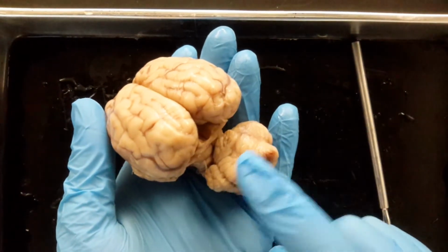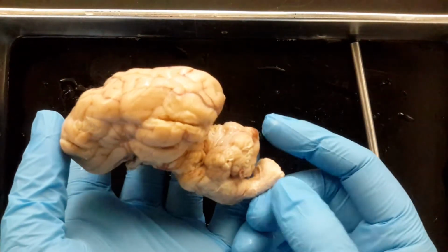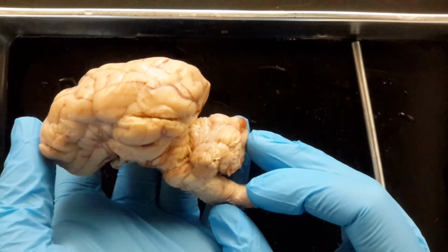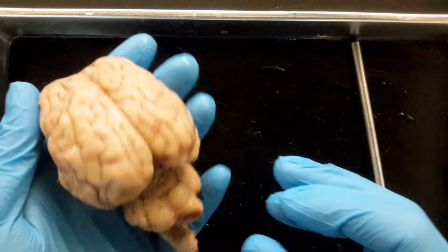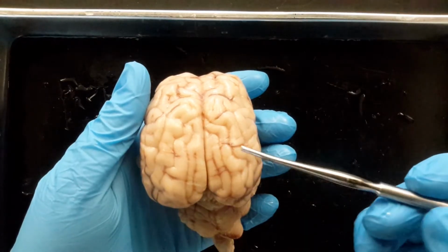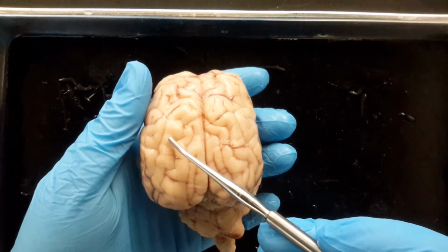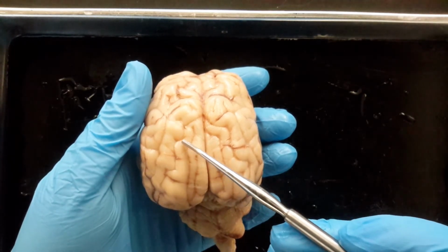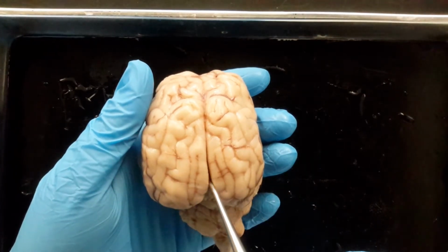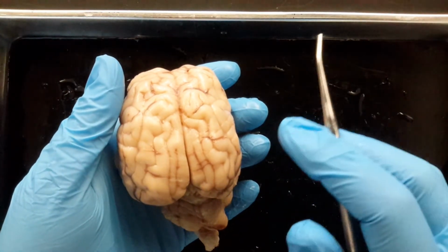Behind the occipital lobe, we have this little structure that kind of sits below, like here. See that? That's our cerebellum. Okay? Now, we talked briefly about this before, the folding of the cerebral cortex. So, where you have the bumps, what do we call a bump? The gyrus. And when it folds in? Sulcus. Good. And then the really deep ones are called fissures. Excellent.